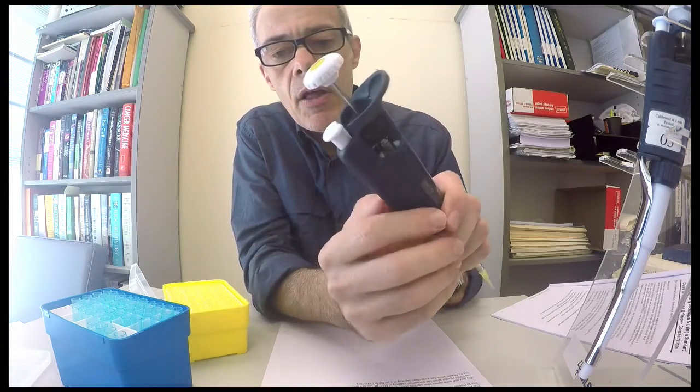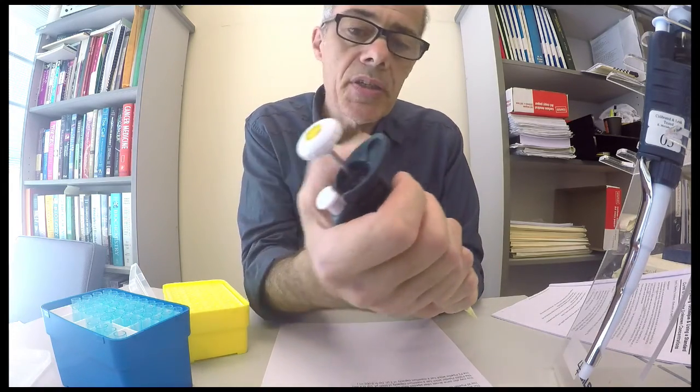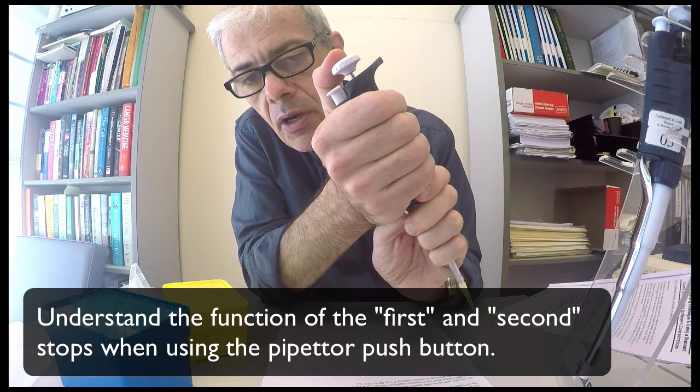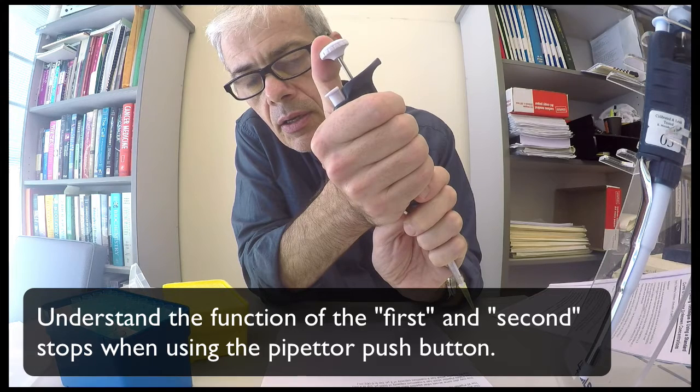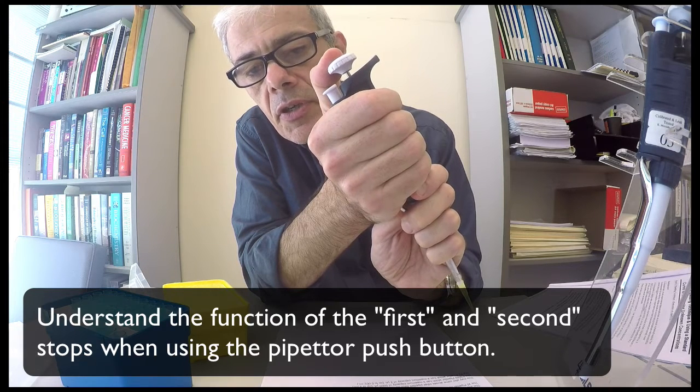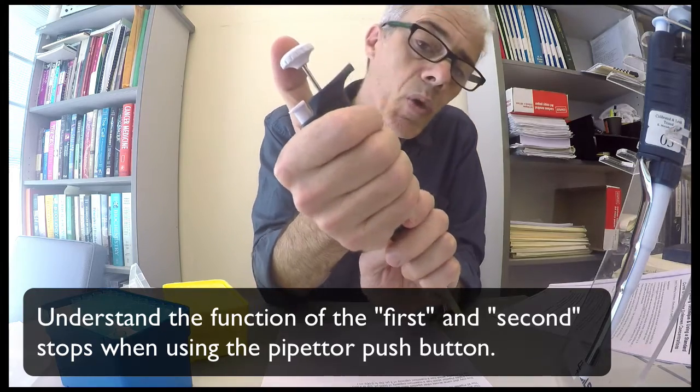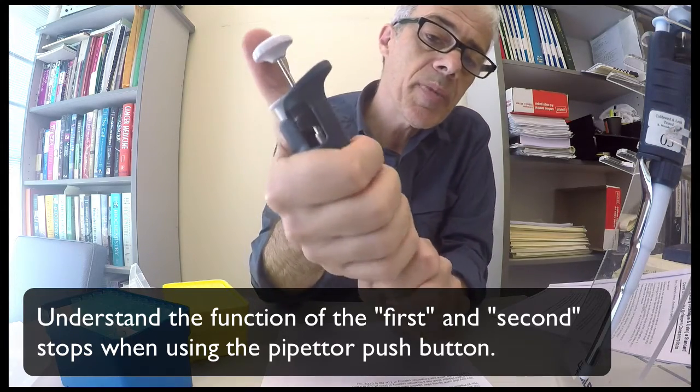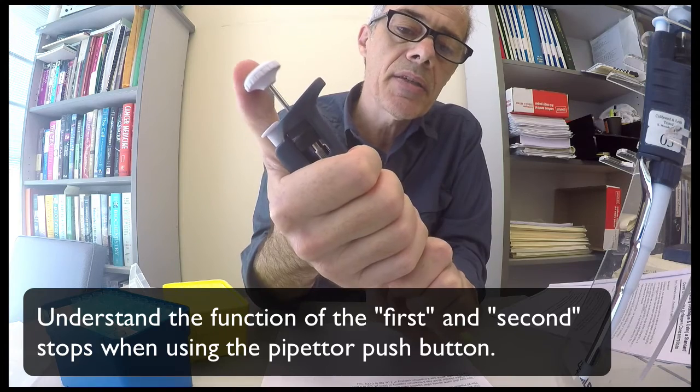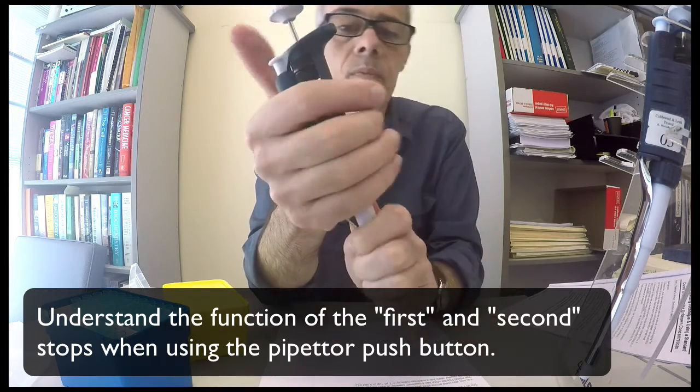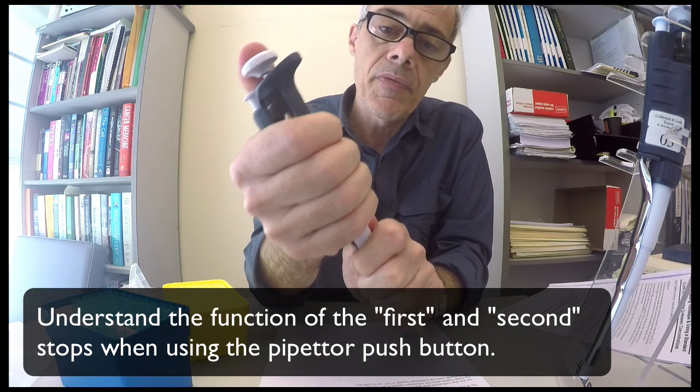Now there are two positions that this plunger will work at. There's the first one and then there's the second one. The first one is calibrated, so when I dispense it to the first position it's going to dispense the volume that's written on this scale here. So that's the first position.